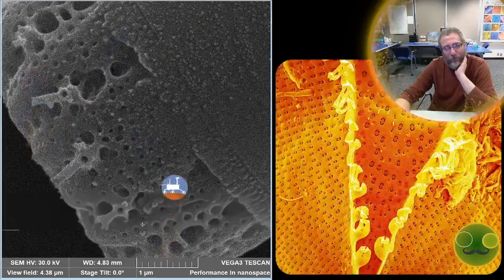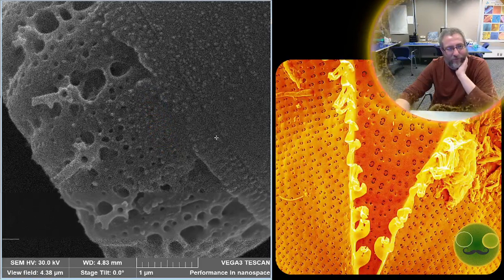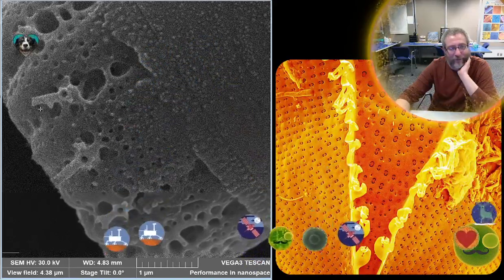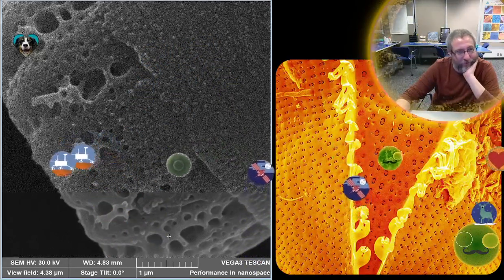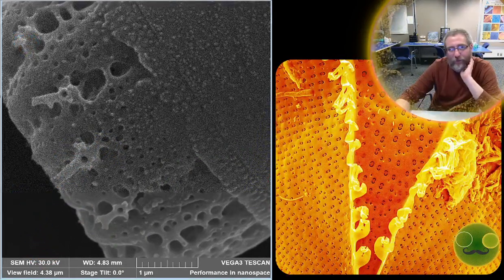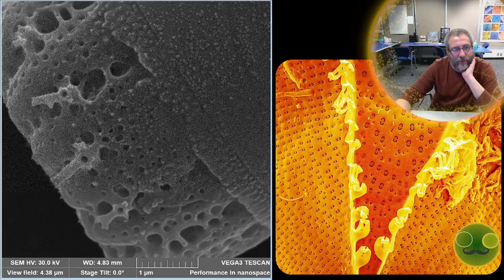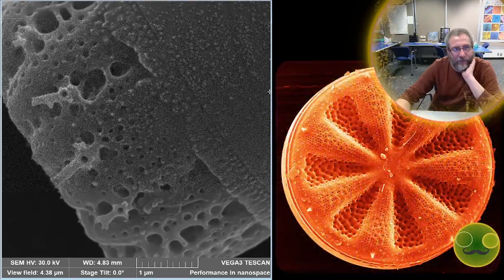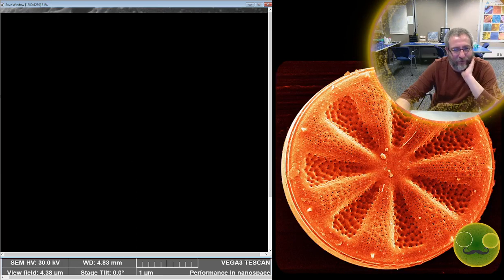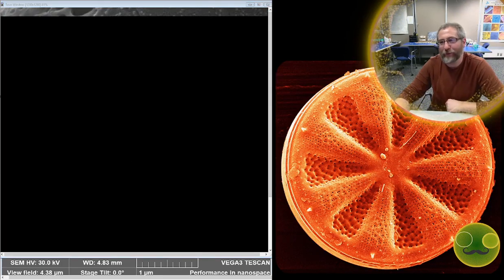Chasm between these ridges or whatever that are indentations that are here are very weird. Okay, I'll put it on 7, beam 6, and then this looks okay. I'll take a picture. It's a very strange little beast. It looks like a beast of the forest.